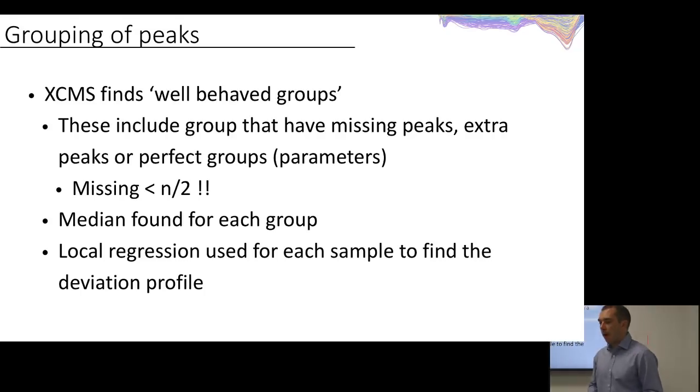And what these well-behaved peak groups mean is they are groups that I have one peak from each file inside the system. And I do have an option for missing peaks and extra peaks in case I need those. And this is used during the alignment system.